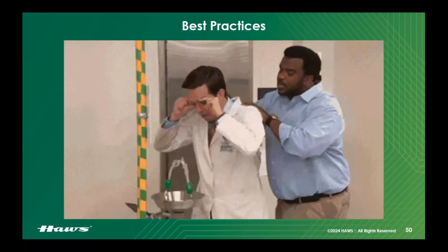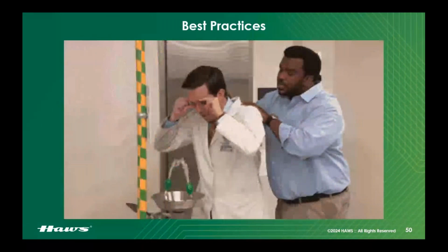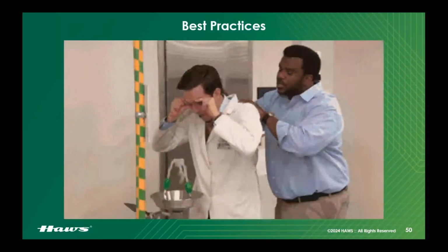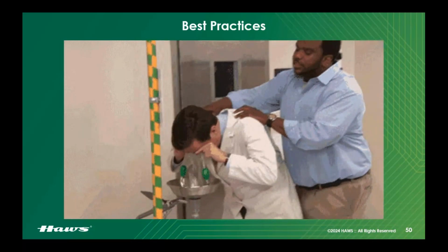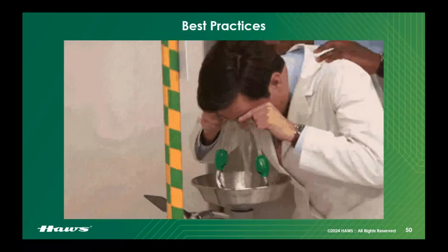I can't stress to you how incredibly important this is. You have to dig in deep. Get those eyelids back as far as possible and let that water get up, in, and around your eyeball. Also, rotate your eyes, ensuring that you get full coverage.